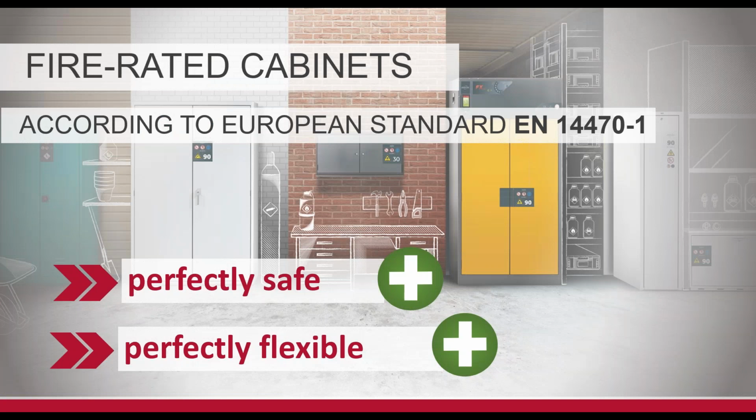So putting fire rated cabinets, 90 minutes, inside a laboratory space is 100% safe, period. I'm going to show you a quick video here. This talks about in general the way the 90-minute cabinets work. I talked about passive versus active. Passive means I have a piece of metal. So 10-minute cabinets are a box in a box. You've got a box, and then you've got a 1.5-inch air gap, and you've got another box behind it. When they are burned, that air, sometimes a little bit of insulation, provides that safety.